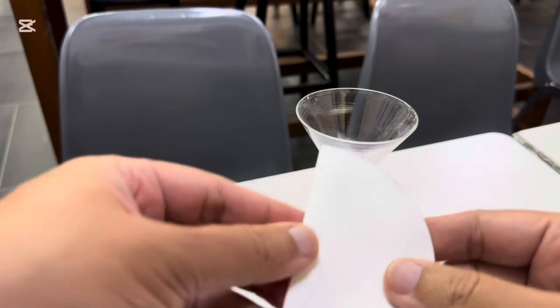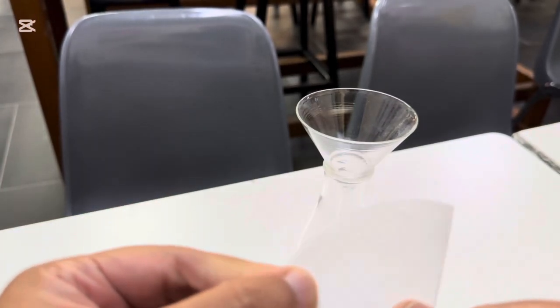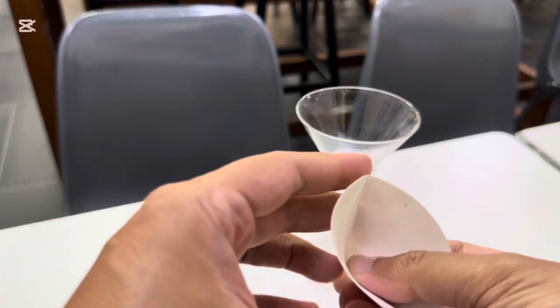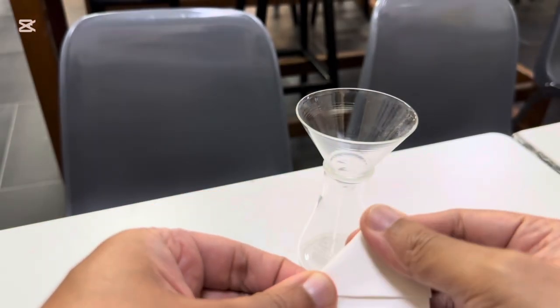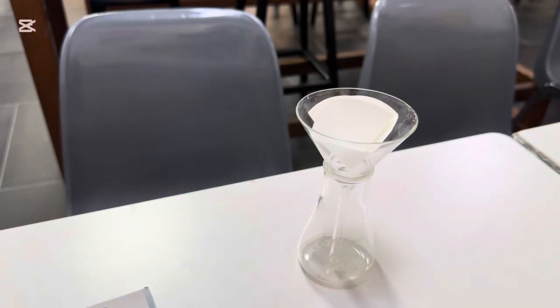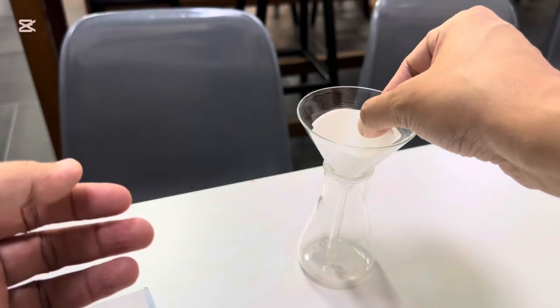Now, traditional school science has a process where you just fold the filter paper like this. The idea is that it's very easy, very straightforward to do. All you need to do is fold it in half, fold it in quarters, and then pop it into your filter funnel like this. But unfortunately, this is a very, very slow process.